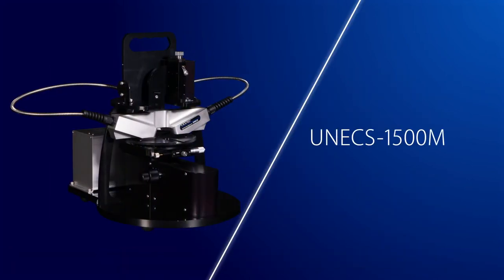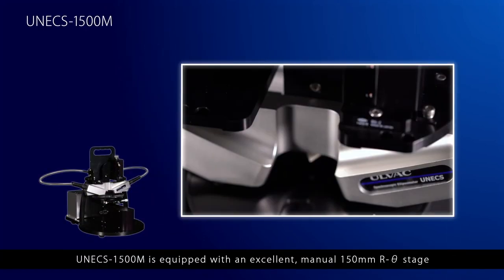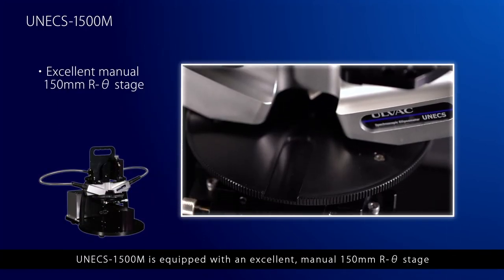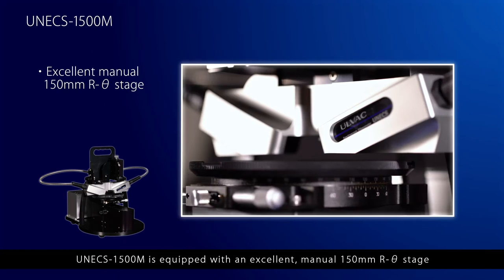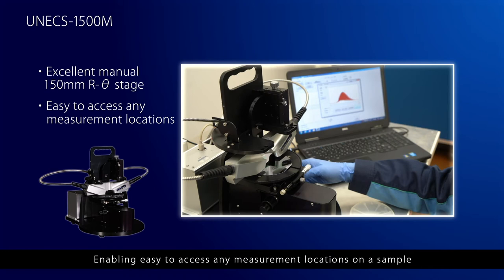UNECS-1500M is equipped with an excellent manual 150mm R-theta stage, enabling easy access to any measurement locations on a sample.